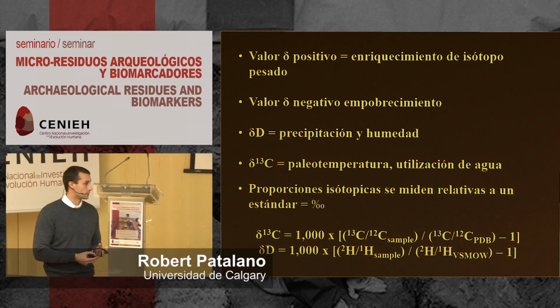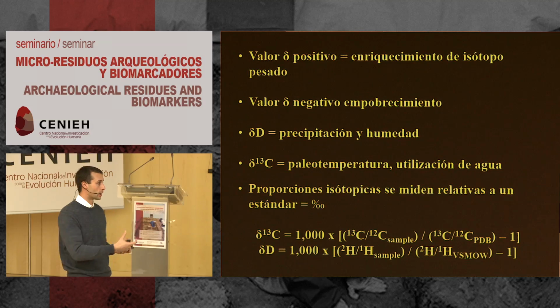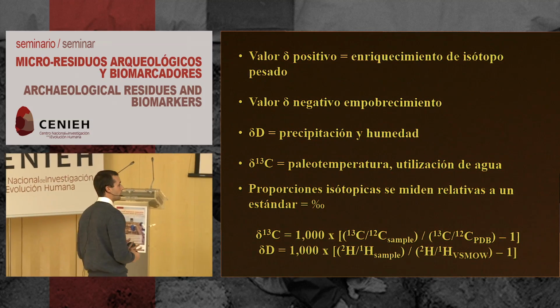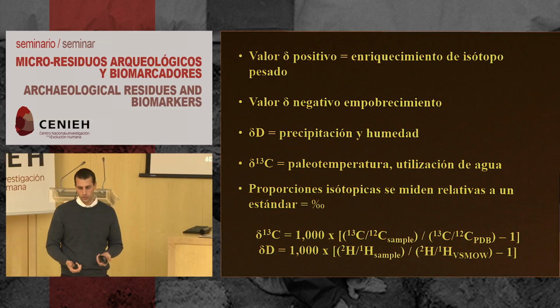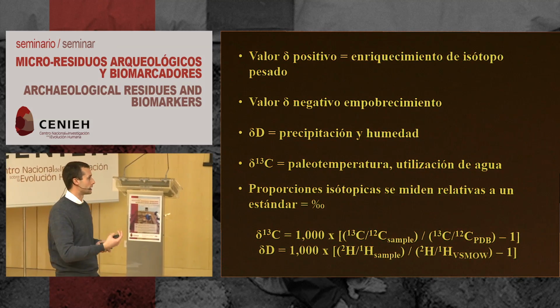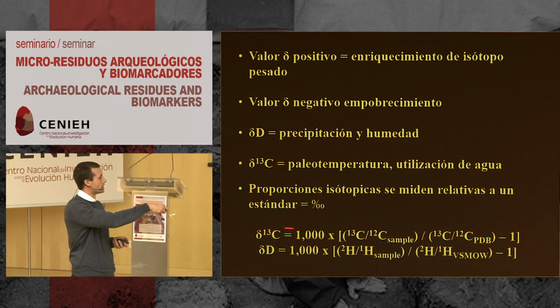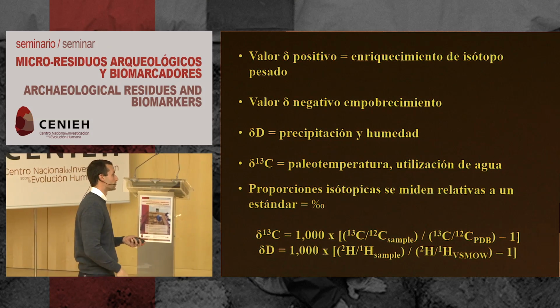It was a paleogeologic outcrop in the US. And now we use these to identify. So why is this important? When we're looking at our compounds, our C27, 29, and 31, we're really interested in this output. What it means, what is the ratio between the heavier and lighter isotope.